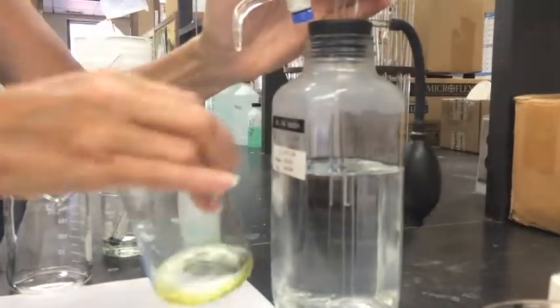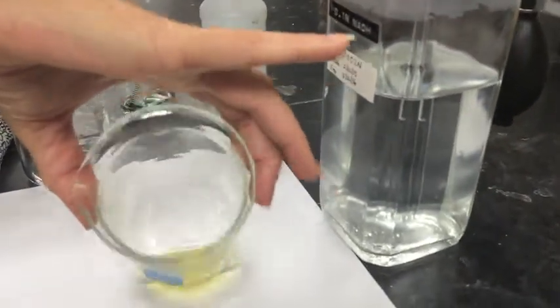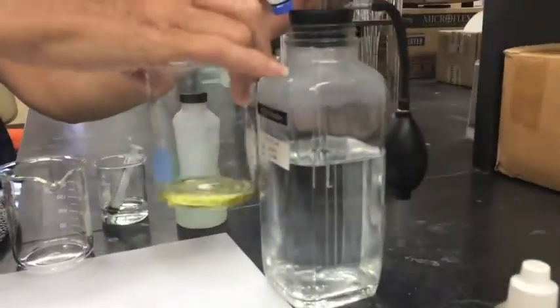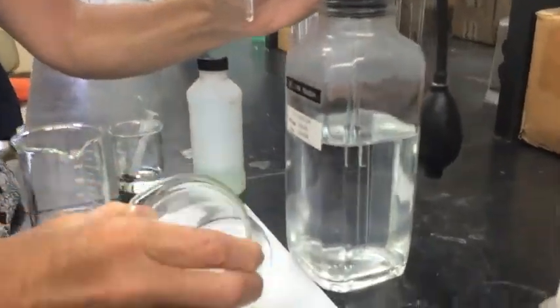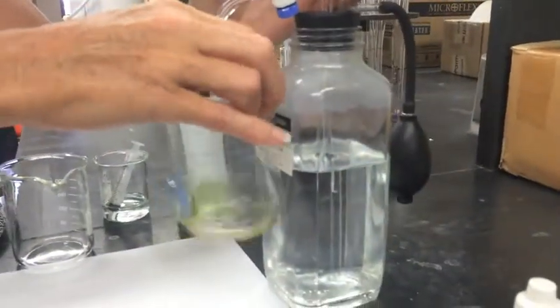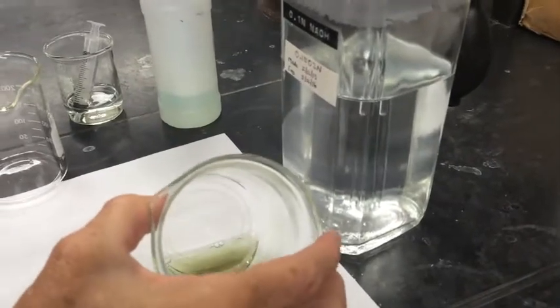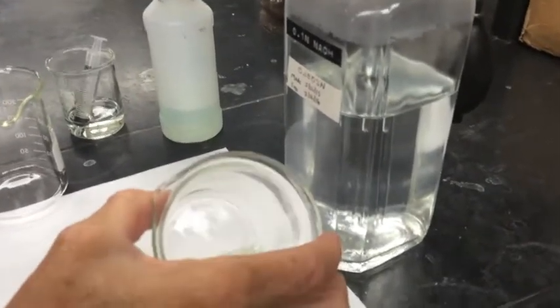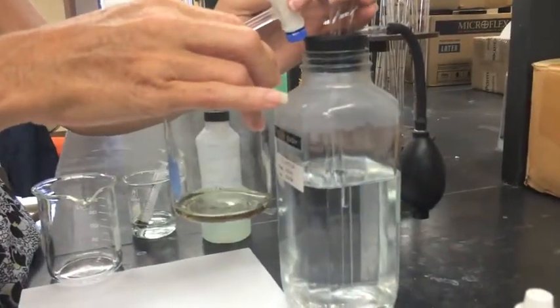And let me stop, and on the white background you can see the yellow is still there. So we're going to add more. Very small amount at a time. Check it against the paper. The yellow is still there. Even though it's starting to turn blue at this point, there is still a tinge of yellow there. So now I'm going to add very slowly, maybe just 3 or 4 drops.